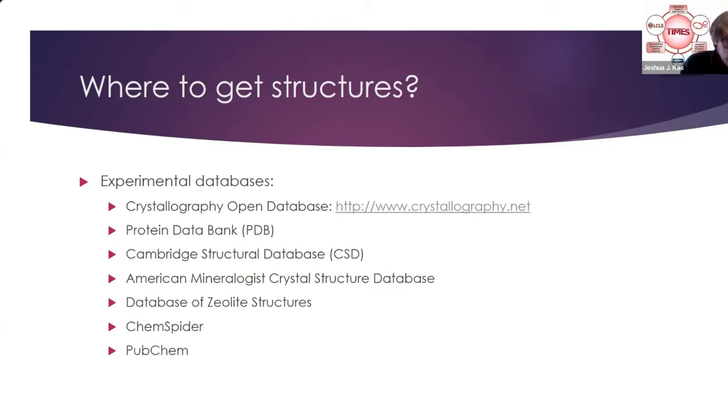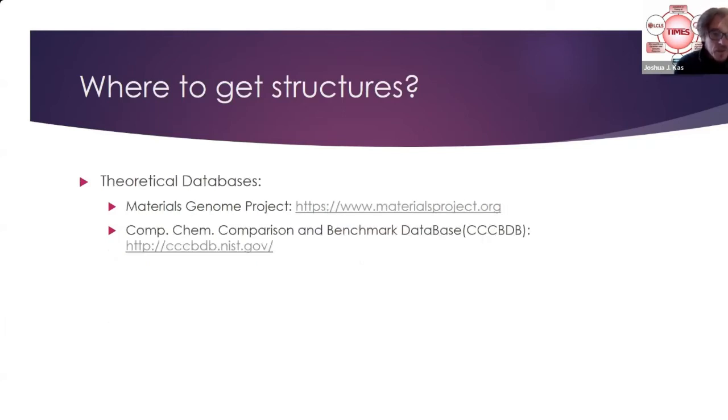It's one code that does that. But anyway, there are lots of places to get crystallography, at least CIF files. And then you can also get them from theoretical databases. So for example, the Materials Project has lots of different materials calculated using VASP, where they've calculated the lattice constants and things like that in the structure using VASP.